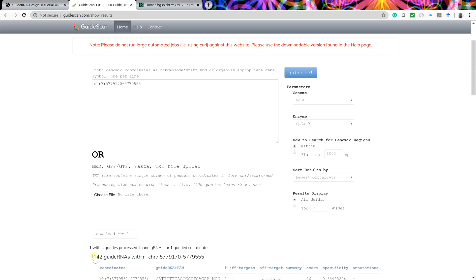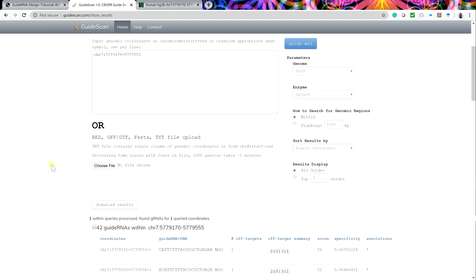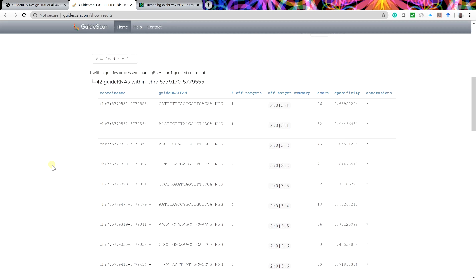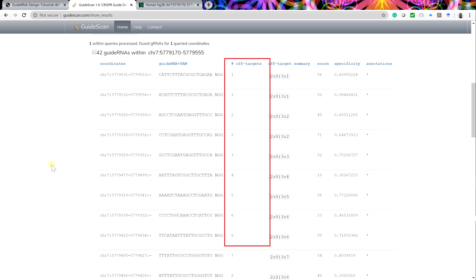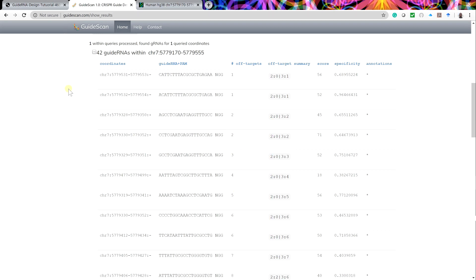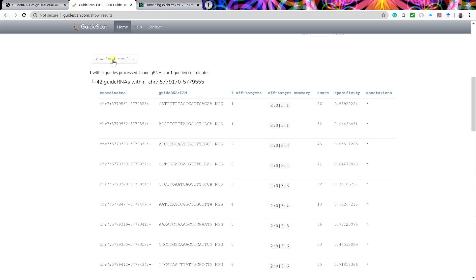By pressing the expand button, these can be quickly viewed. At a brief glance, we try to look for a low number of off-targets in the top 10 or so sequences. If the guides look promising, press download results to export the list and view it in a spreadsheet.